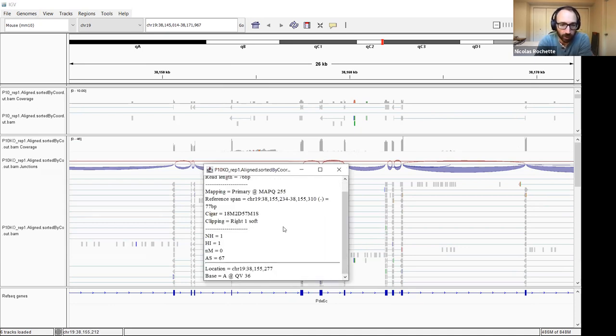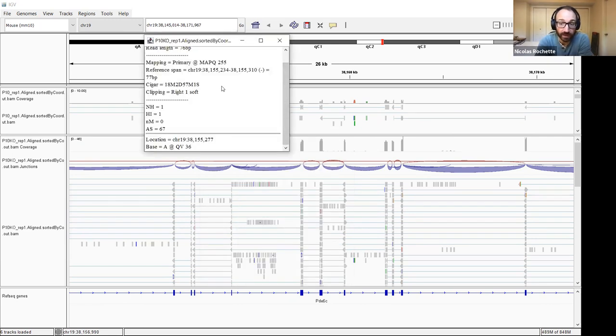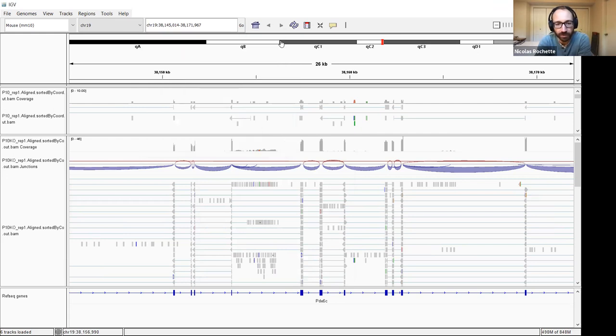It could be just remains of RNA that's not being entirely spliced. It could be things that are actually multi-mapping, that are mapping there for not good reasons, as long as the coverage is much, much smaller than for the rest. I think it is in the same direction in this case, but sometimes you see it in the other direction, which suggests that it's not actually coming from the same transcript. But very often it's just mapping from repeated regions that may or may not be reliable.